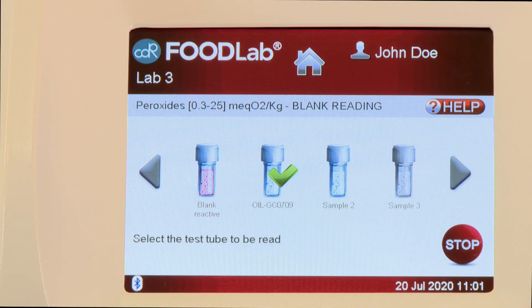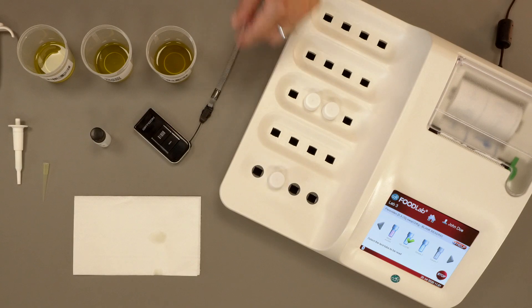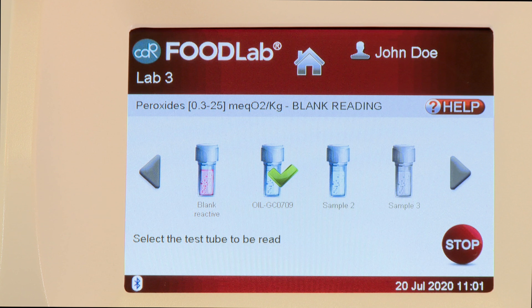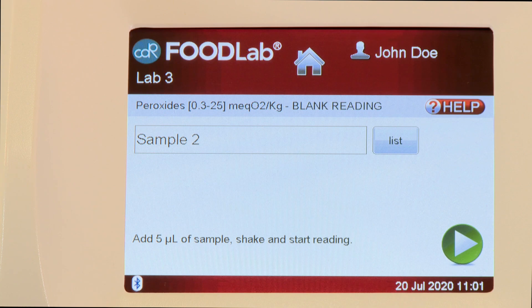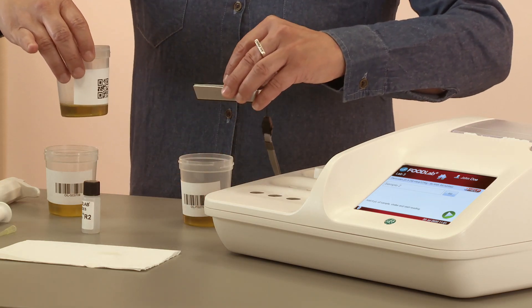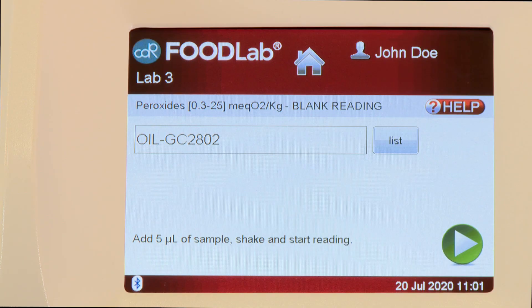At the end of the reading, place the first test tube back in the incubation cell. After that, select on the screen the second sample to be read. Read the barcode of the second sample by using the PX20 Reader. The second sample code will appear on the screen.